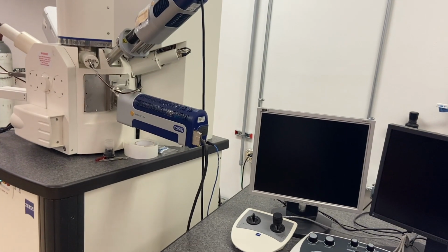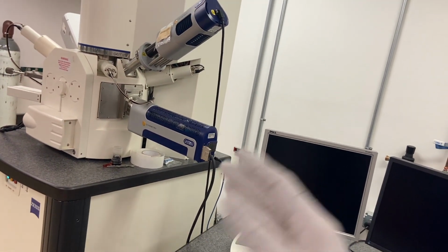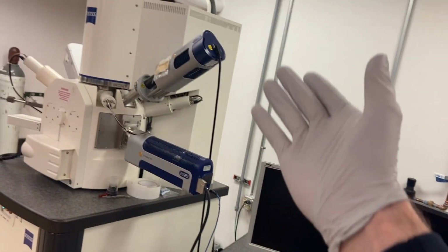You don't really want to have a thick carbon coat because you're going to get artifacts in some of your diffraction patterns. You want to keep it as thin as possible, but since I'm not worried about it for this purpose, I'm just using an X-ray detector, I don't need to worry about having a thicker carbon coat.